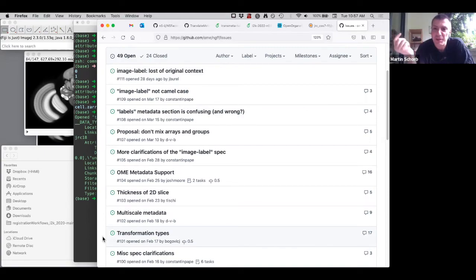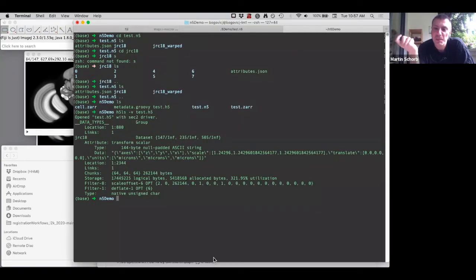So it depends on what Fiji can open as a single entity, what will happen on the user side. Users are lazy, and if they find out that they can copy the second level of the OME-Zarr directory directly into Fiji and it will open, they will use that as an image file, whatever they understand that to be. And this will be the basic entity, no matter what we define in the spec, it will be what the users do.